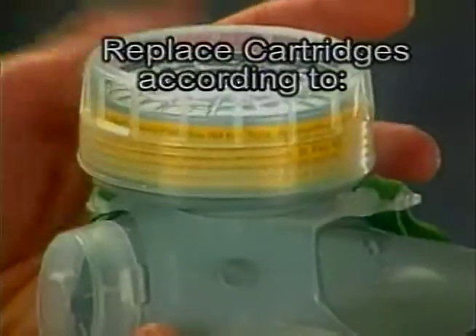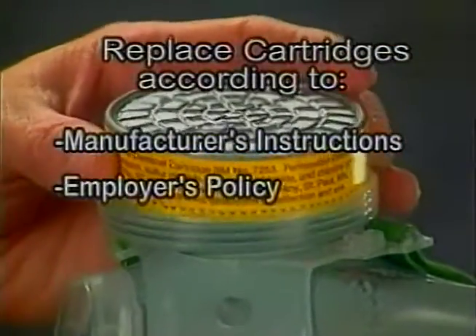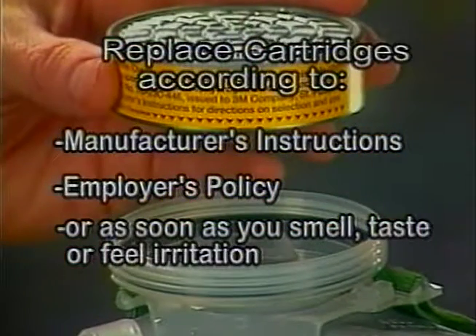The top of the workbench is the worst place to store your respirator. Cartridges should be replaced according to the manufacturer's instructions, the employer's policy, or as soon as you smell, taste, or feel any irritation.